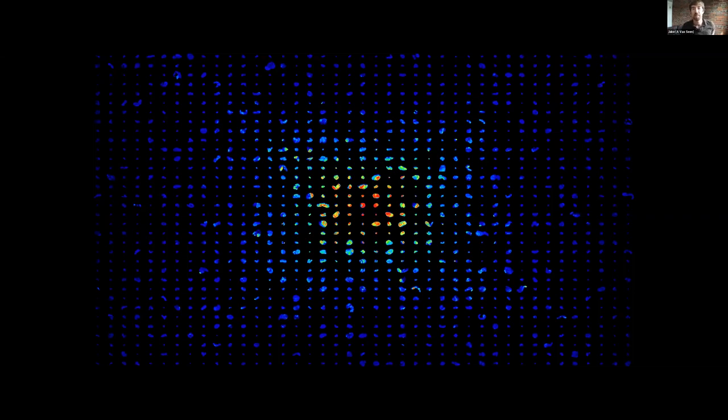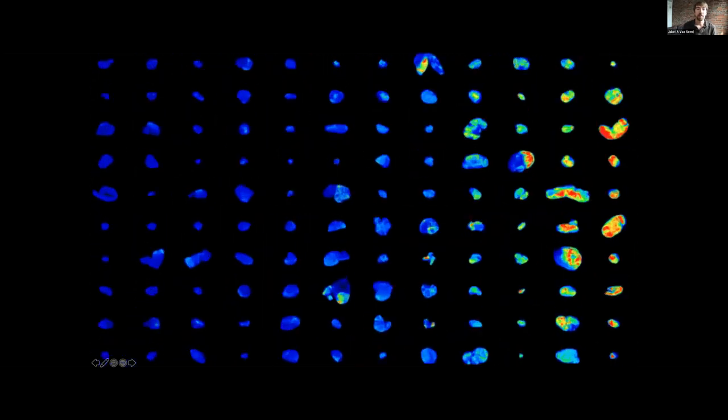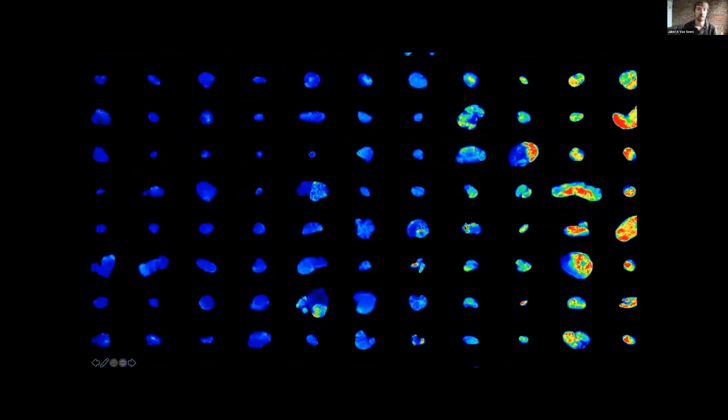So here's the image that Erica was describing that is a composite of several different images. So I'm going to tell you not just about how I made this image, but also about how the information in this image is helping us make advancements in vaccine research. So if you look closely, you'll realize that this is actually made up of thousands of smaller images.